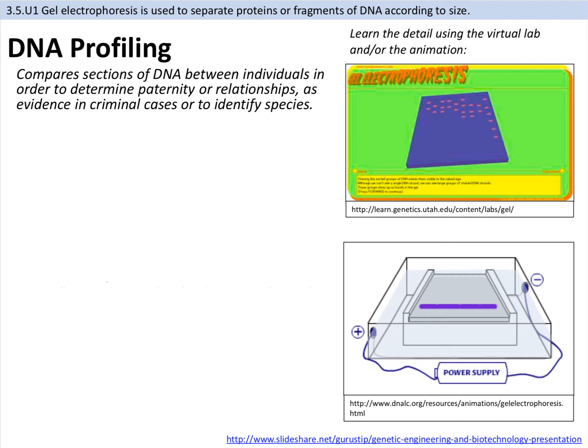And so if potential father C's banding pattern matches most with the banding pattern sections that overlap with the mother, and therefore match up with the banding pattern sections we see with the child, then it's most likely that that individual is the father, because that's how that would occur, is that mixing of their DNA. Half the DNA coming from the egg and half the DNA coming from the sperm. We would expect the child's DNA banding pattern to be a mix of both of their DNA.